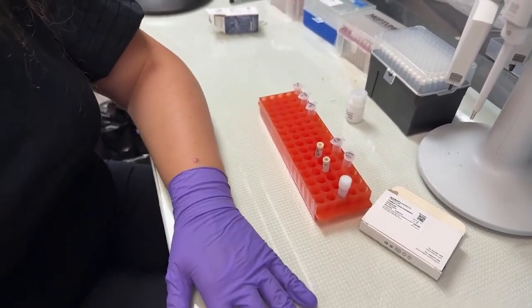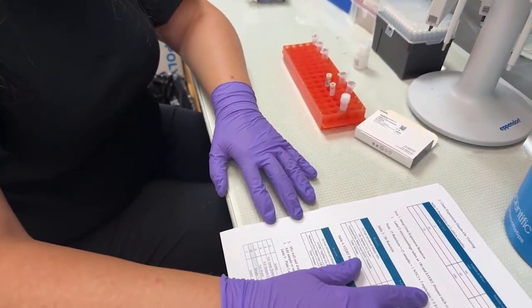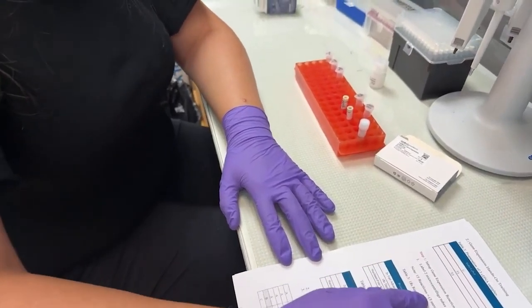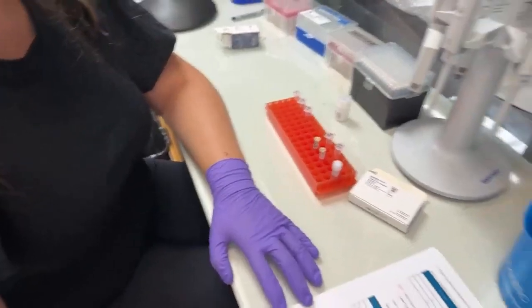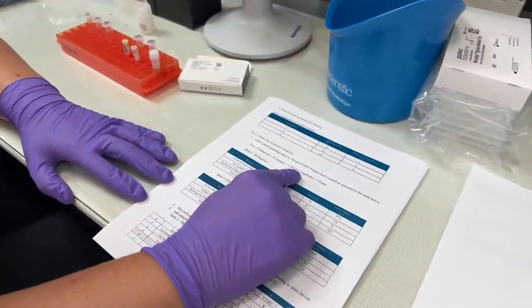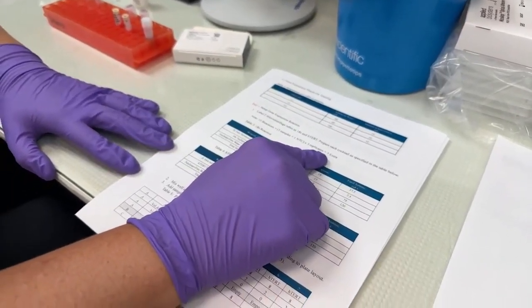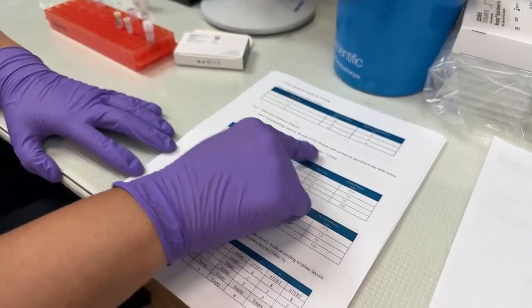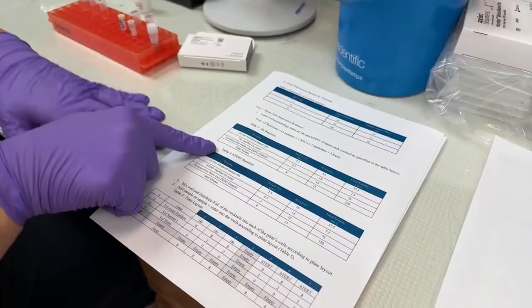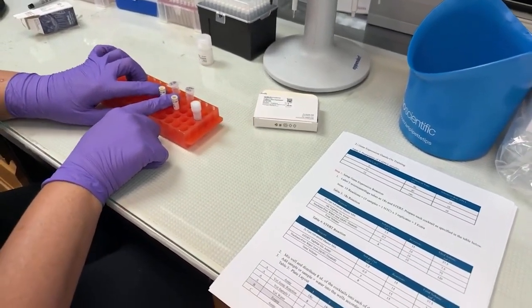So I'm going to make enough for all of my reactions plus some extras. We're going to have 3 samples plus 1 no template control. I'm going to run each of those in triplicate, so 3 replicates, and then I'm going to make a few extra just in case I have any pipetting errors. I'm going to make all of that in bulk for each of my 2 reactions, and I have 2 tubes prepared here, so let's get to it.